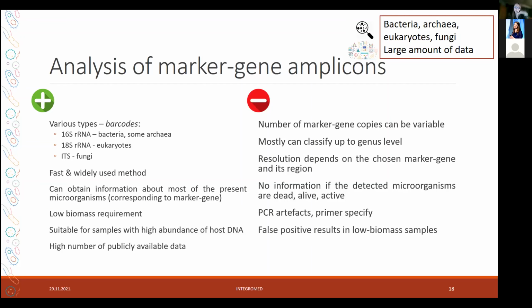We could also get some false positive results in low biomass samples. That could be due to the fact that microbiome is everywhere, therefore we could have some contamination from the environment. And we know that the reagents for PCR are also obtained from microorganisms, so there could be something left in the reagents, and we could get some false positive results.